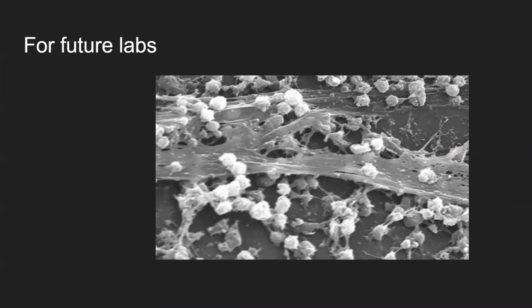So what can we do for future labs? The lab is planning to research about biofilms. It will help to collect further data with details since metals can be clogged and attached in these biofilms. I will be able to observe higher concentration of heavy metals. Even some more types of heavy metals can be detected since biofilms can have higher concentration of heavy metals that couldn't be detected earlier.